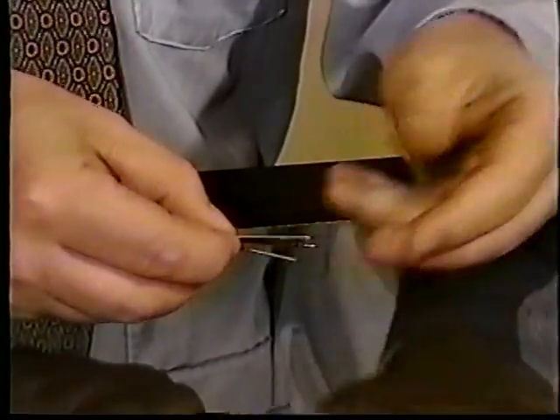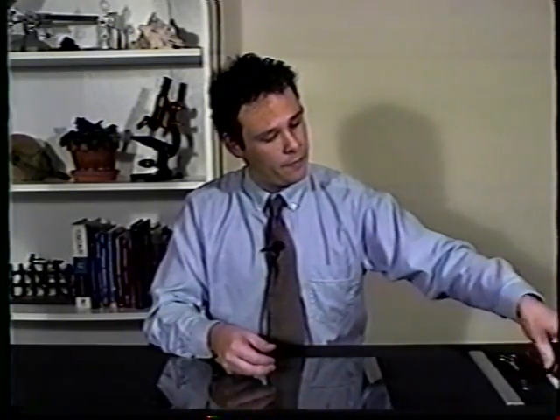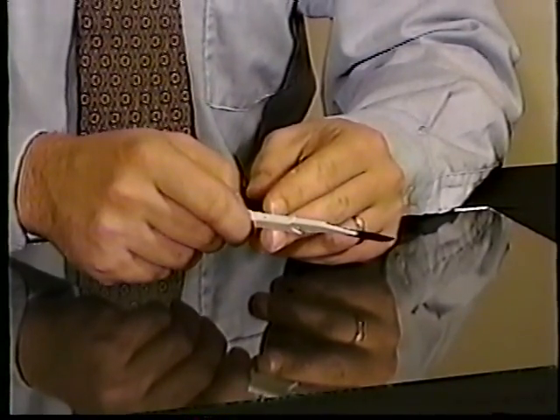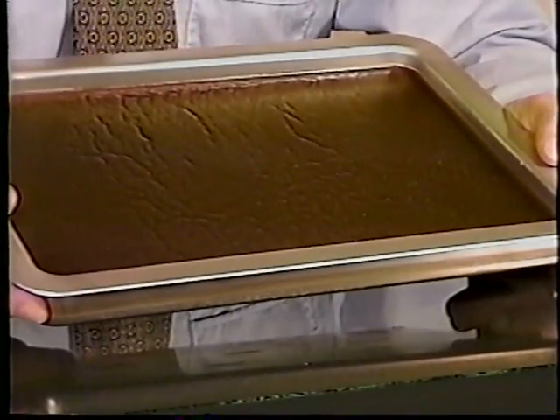Pins serve to keep our specimen fastened closely and tightly to the dissection tray. This will cause the frog to stay secure and not slide during dissection. The scalpel allows us to cut through anything that our scissors will not allow us to. Bone is an example of this. And finally, the dissection tray is where our dissection will occur.